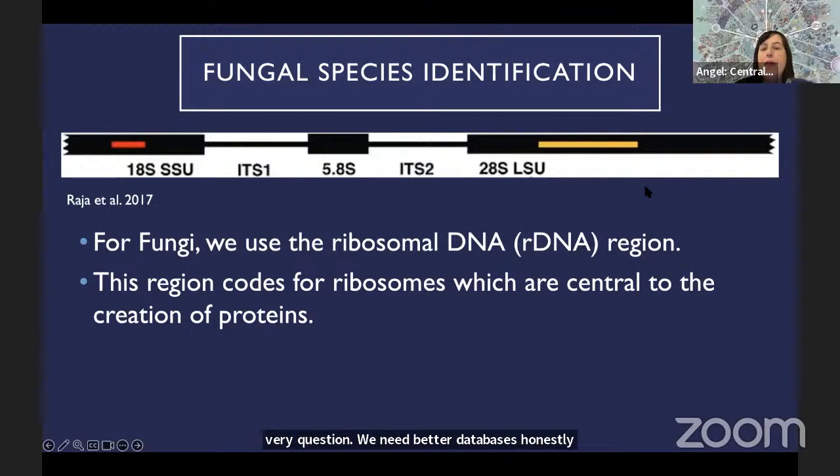And what did you say the name of the database was again? It's NCBI. Here, I can pull it up.